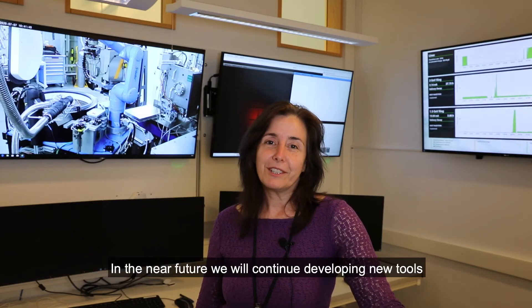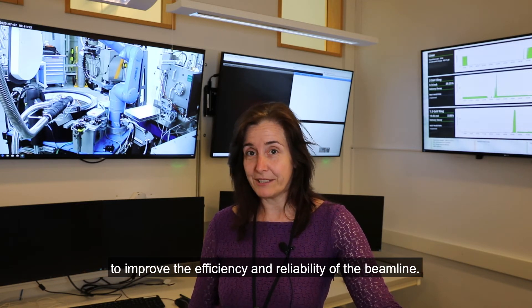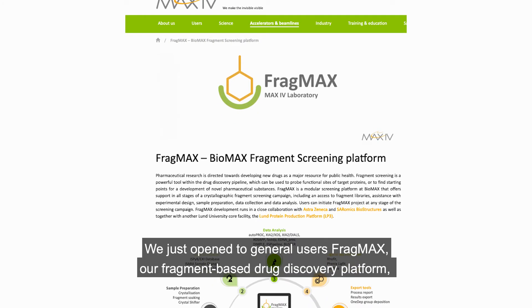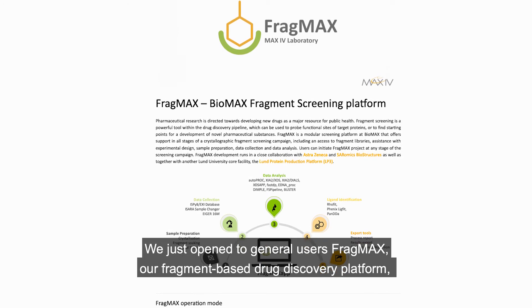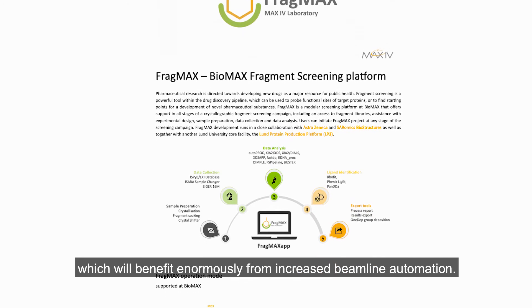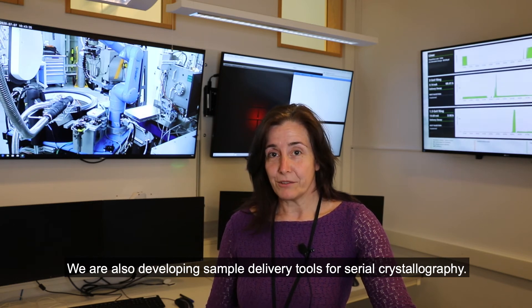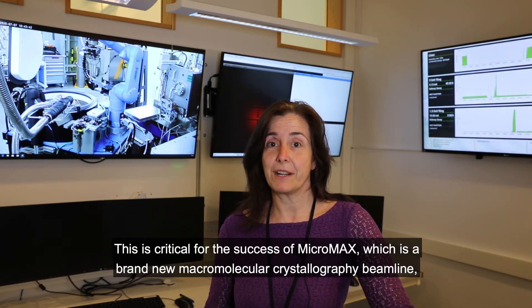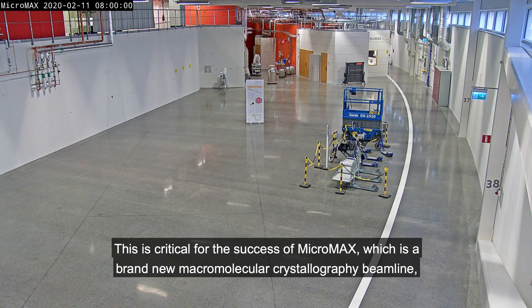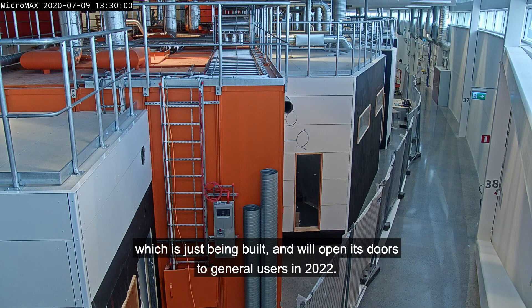In the near future, we will continue developing new tools to improve the efficiency and reliability of the beamline. We just opened to general users FragMax, our fragment-based drug discovery platform, which will benefit enormously from increased beamline automation. We are also developing sample delivery tools for serial crystallography. This is critical for the success of Micromax, which is a brand new macromolecular crystallography beamline that is just being built and will open its doors to general users in 2022.